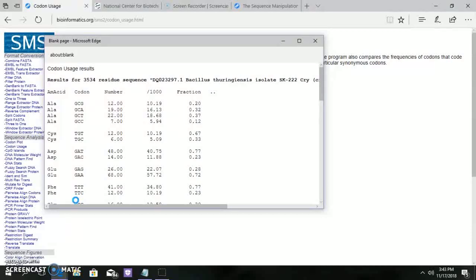The question might arise why we are doing this codon usage. It is because for optimal translational efficiency, and this is highly pronounced in expressed genes in species whose effective population size is large.